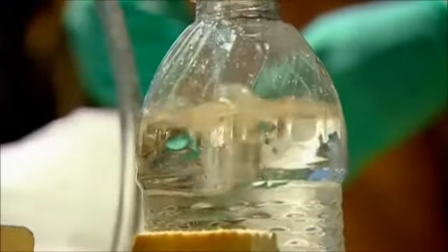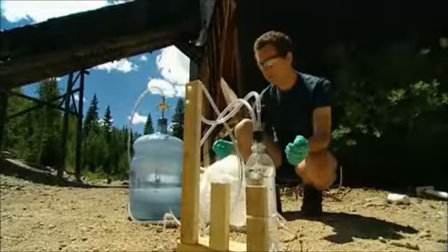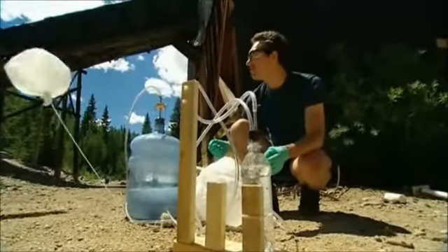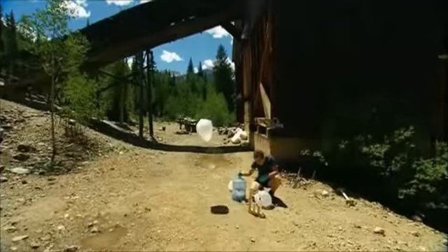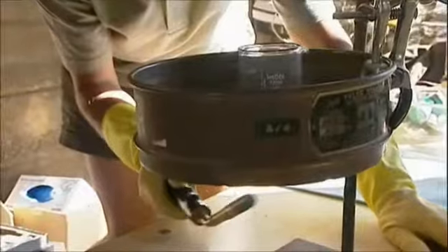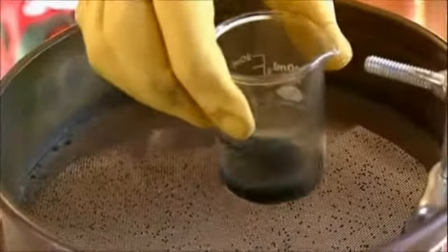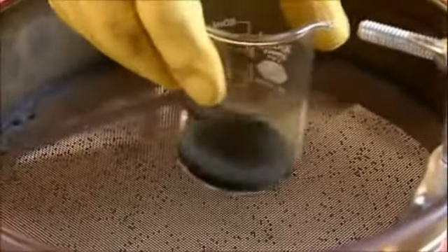Meanwhile, Jonathan's filling up hydrogen balloons for tomorrow's airmail delivery. It's a bit slow, much slower than I thought it was going to be, but it's getting there. It's just a matter of time to fill up as many balloons as we can for the challenge. Hermione's crushed silver ore and Mike's nitric acid finally come together. It's really boiling now. And there seems to be a reaction. Hopefully, they've made silver nitrate, but they won't be able to test it until tomorrow.